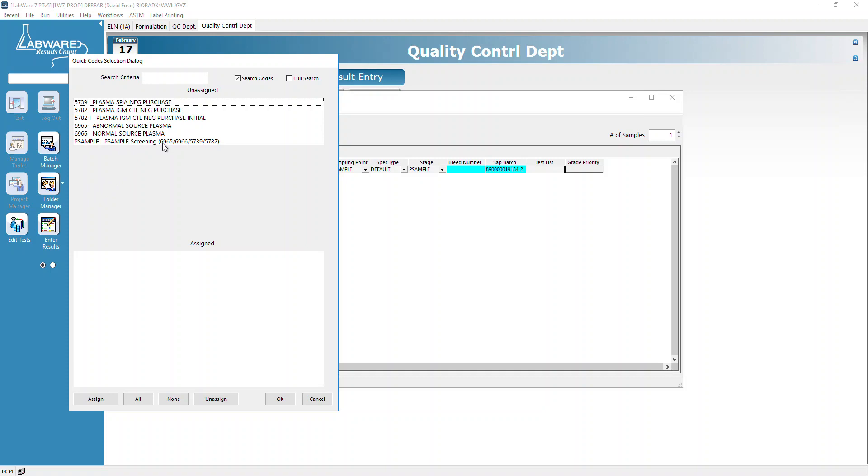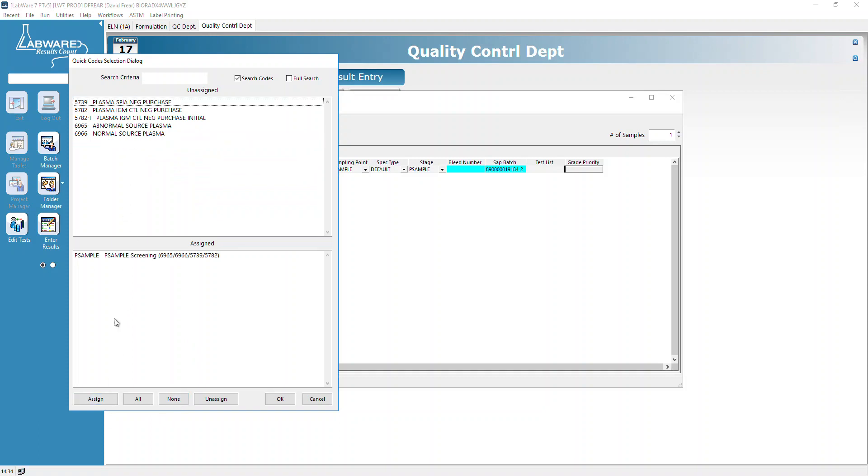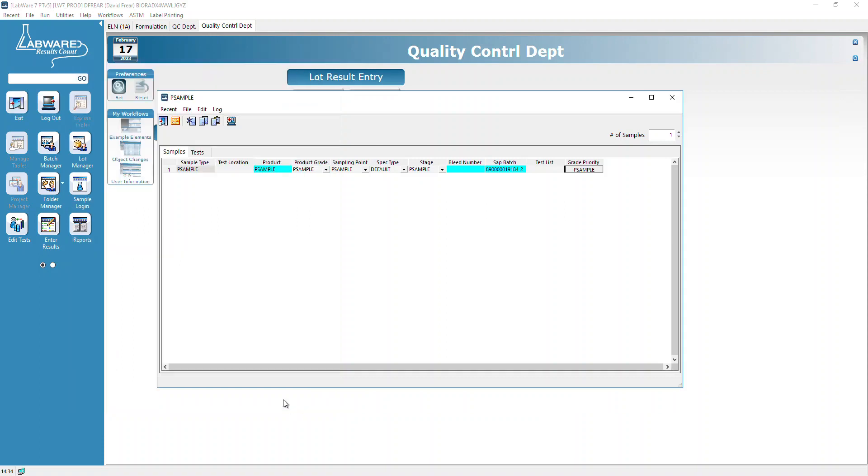This time we're going to do the P sample screening for these item codes. You can double-click or select it and say Assign, then click OK. That brings it over here.